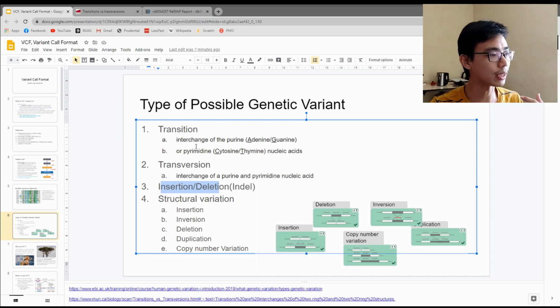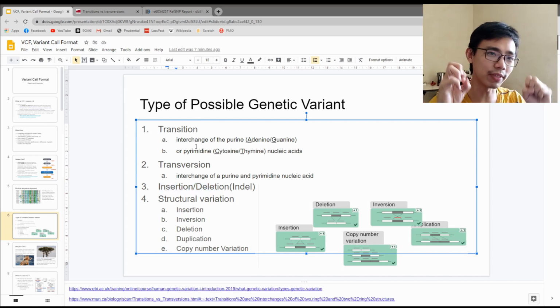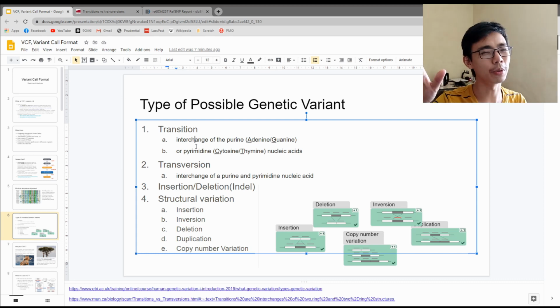So these are just an understanding of the mutation instead of the impact. We'll look at the impact on a case-by-case basis, because every single mutation can cause completely different effects. It might completely change the phenotype of the host or not at all.